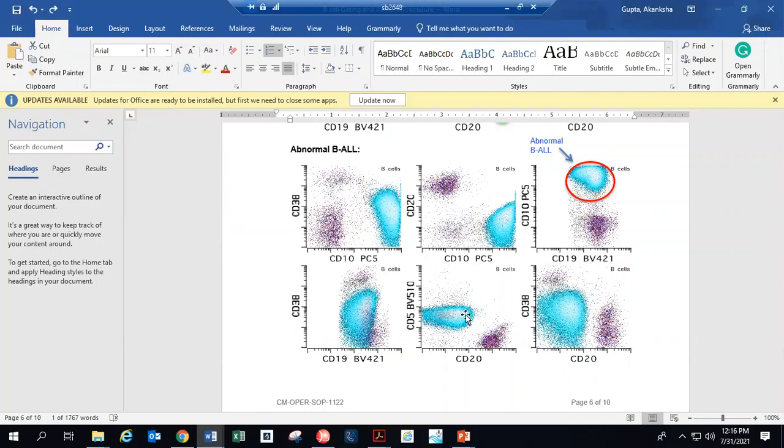And I have a question for our audience. Assuming the patient is a known case of follicular lymphoma or whatever, and they have got rituximab, which is an anti-CD20 monoclonal antibody therapy, how would you differentiate that? I'm not able to hear very well. Your voice is very dim for me. Can you please repeat the question?